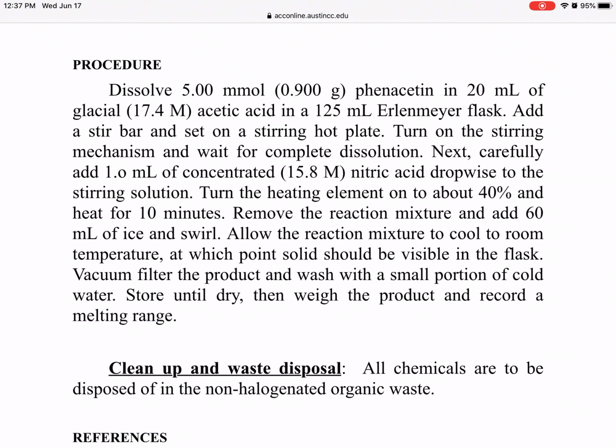One popular solvent for recrystallization is water, and an ethanol-water mixture is a good combination too. After everything is completely soluble in the hot solution, you let it cool. You don't add too much water or alcohol, otherwise you will not get your crystals back.